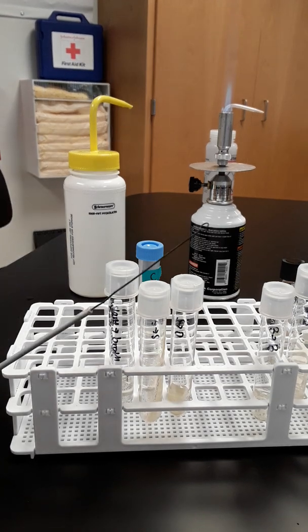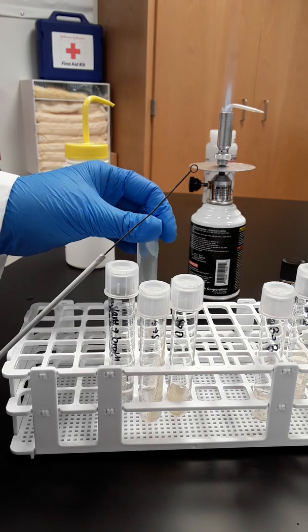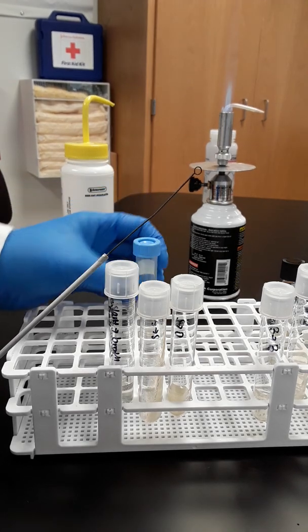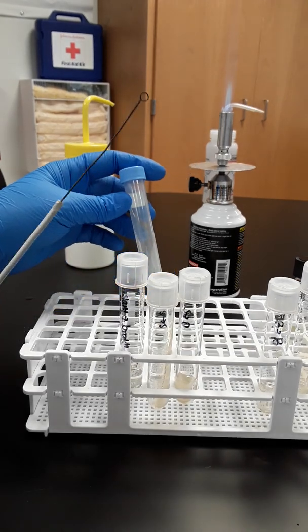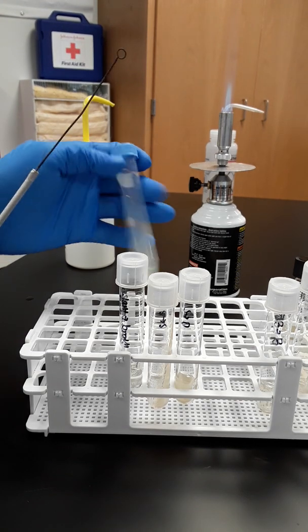You wait 20 seconds to let it cool, because if you put something hot into something alive, it will burn it, and that is not fun. That will destroy the sample. And the point here is to transfer successfully using aseptic technique from here to there.